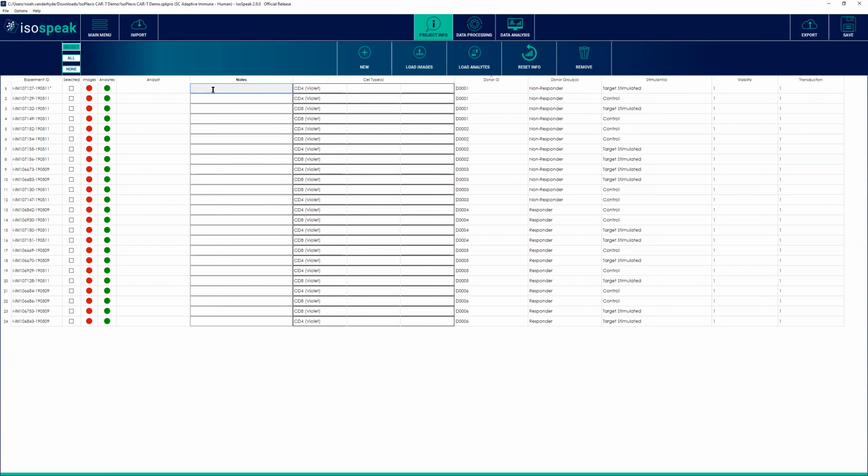Next up, this is a laser-based detection platform, and so we are going to be using either general membrane stains or a few marker-specific stains to detect our cells of interest. In the workflow upstream, you'll be either magnetically enriching your cells or using some FACS sorting to pull your cell types of interest down from your PBMC populations or your TIL populations. Here, we're currently looking at only CD4 and CD8 T cells. But if we type into the cell types here, we can type in C. We have CARs, CD14, CD154, CD3, and so on.